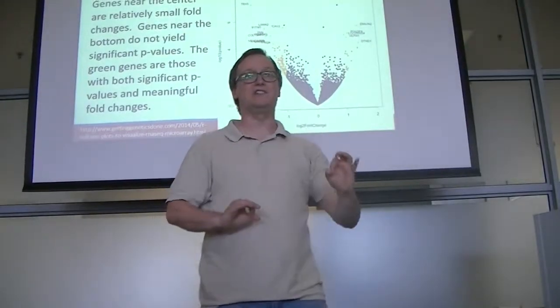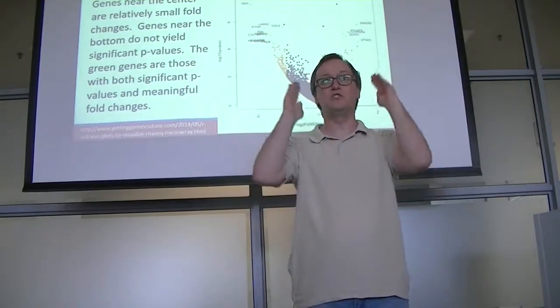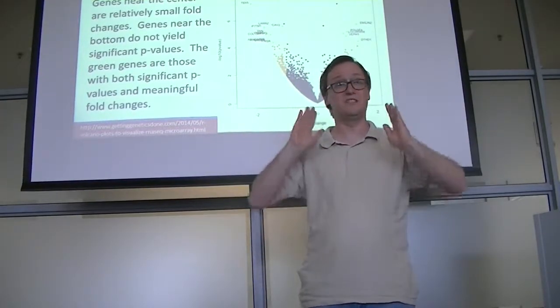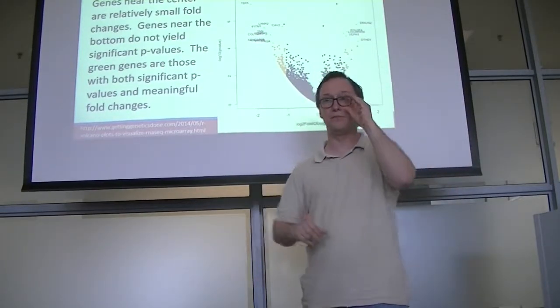Right away, the biologist has said, I don't care about anything in the middle here. Those changes aren't extreme enough that they're biologically important. This is a very common way to read these, so I want you to know about it.